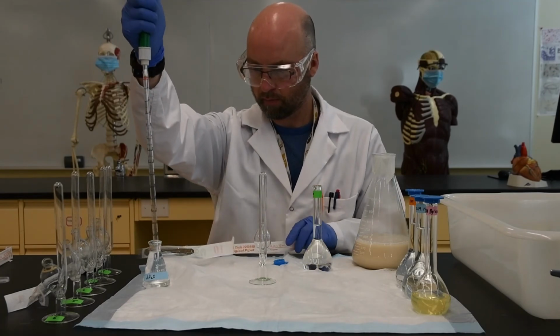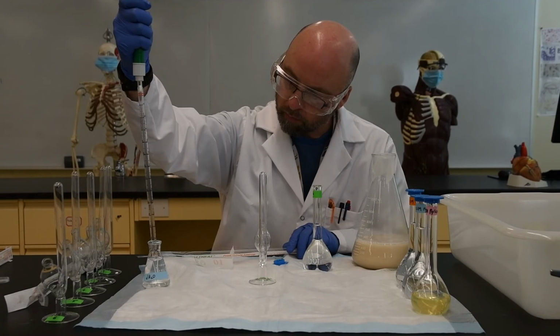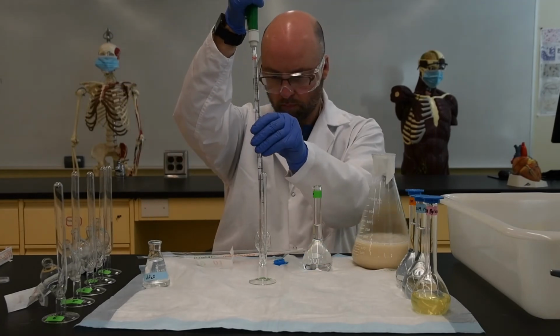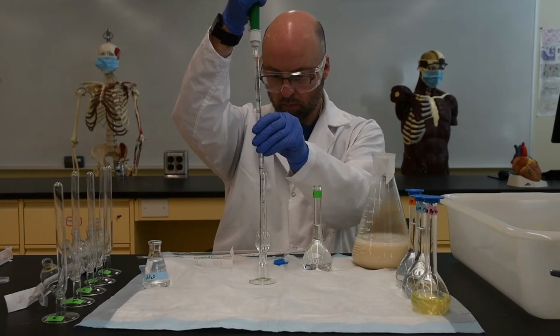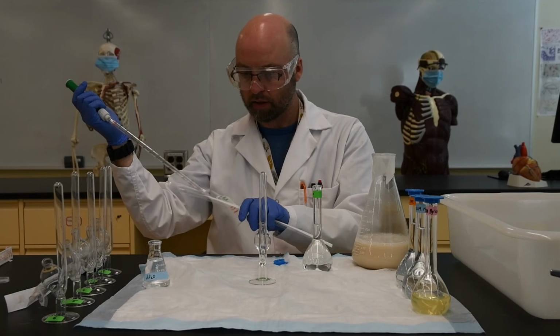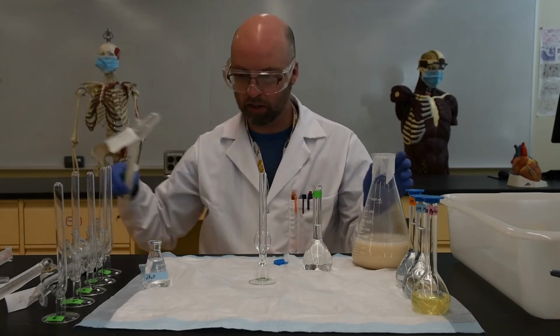Water. And finally 10 ml of the yeast here.